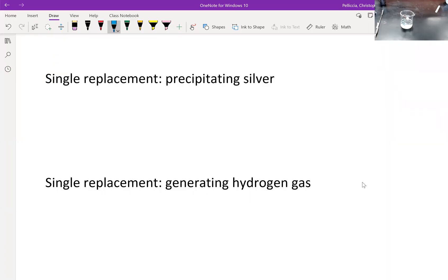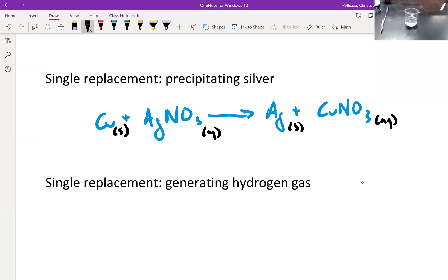The reaction that we've witnessed there can be described as solid copper metal reacting with a solution of silver nitrate yielding solid silver metal and a solution of copper nitrate. Let me add in the states of matter. Copper nitrate solution has a bluish color to it and while difficult to see from the video, there is a slight blue color that the solution is taking on. You may be able to see it better at that angle right there.